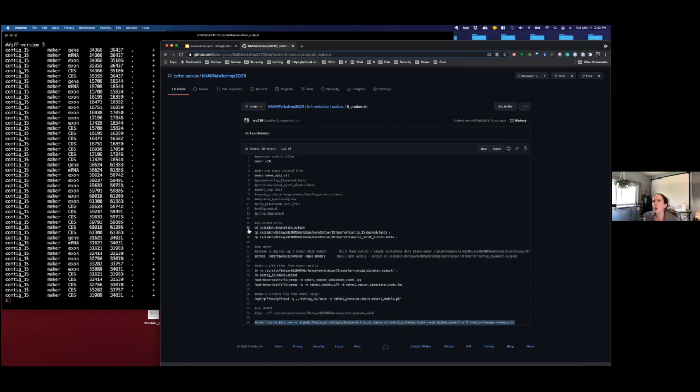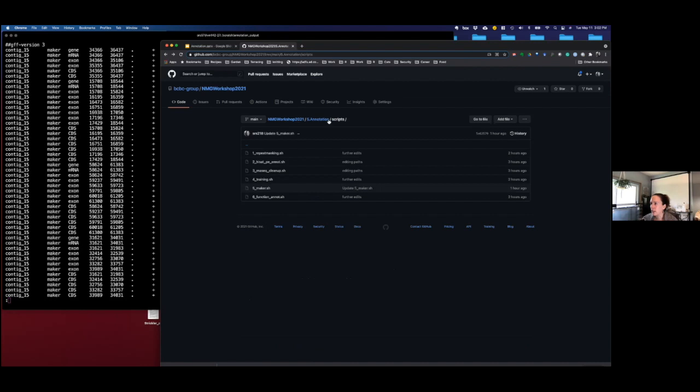So if you know that the BUSCO for the genome is 93%, then if your annotation was really accurate, you should have a number that's pretty similar when you run it on your protein set. If you know that you have 93% of the BUSCO genes in the genome, but you only annotated 60% of them, then you probably need to work on your annotation a bit more. So that's one of the ways of QCing the annotation. Okay, I'm 2 minutes over.